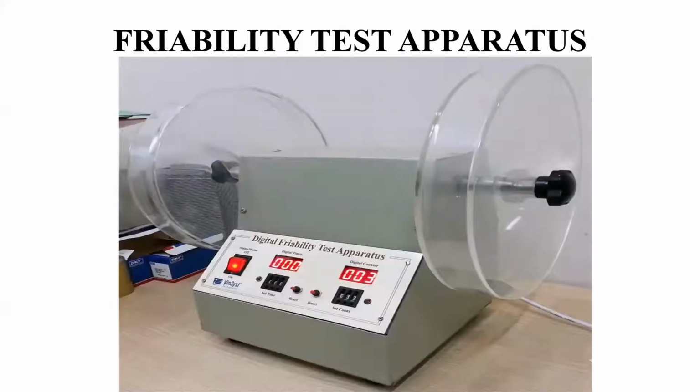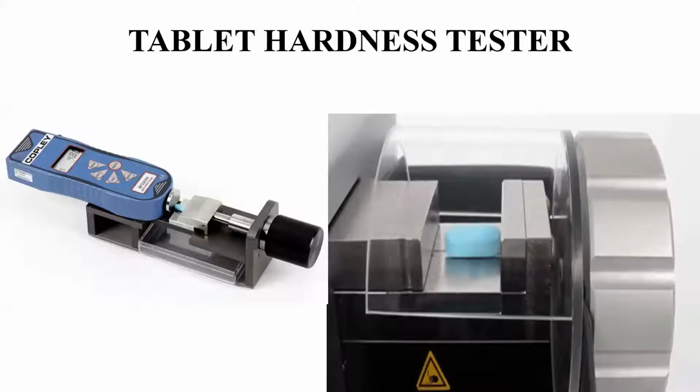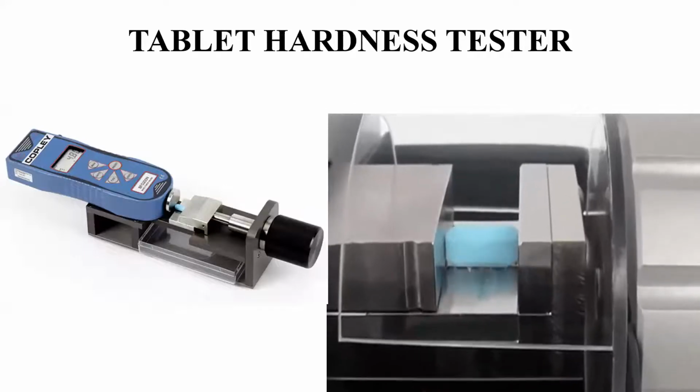This is the disintegration test apparatus. This is the friability test apparatus. Here the dissolution test apparatus. This is for hardness, means to test the hardness of the tablet. Here you can see in the zoom.